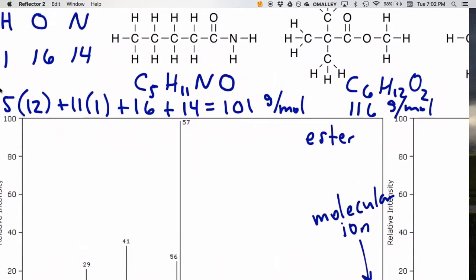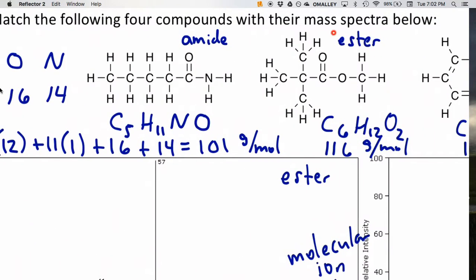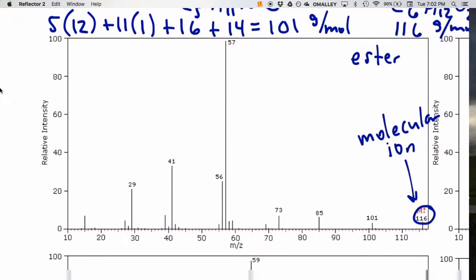Well, under the conditions of mass spectrometry, not only do you ionize the whole molecule and take away 1 electron, the energy that's used to do that ionization is sufficient that you might break some of the covalent bonds, and you're left with pieces of the molecule. Even if they have very short lifetimes, they're detected by the instrument and they exhibit a molar mass. So the rest of these peaks that we see are fragments in the spectrum. And chemists use those fragments to piece together what the molecule might have looked like.